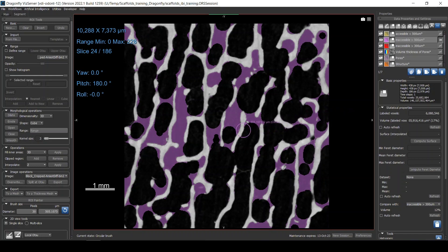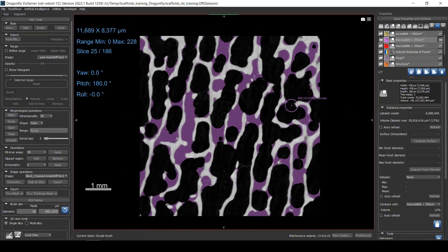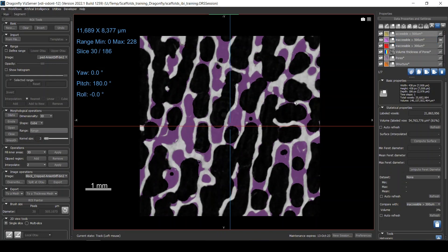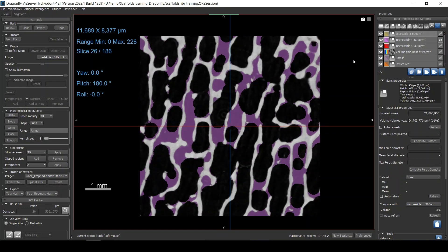So that's the way we use Dragonfly to calculate how accessible the pore space is to a certain threshold — a certain diameter of a cell or structure. And if you want to quantify it, you can simply read the volume values from the interface. That's it for today, thank you.